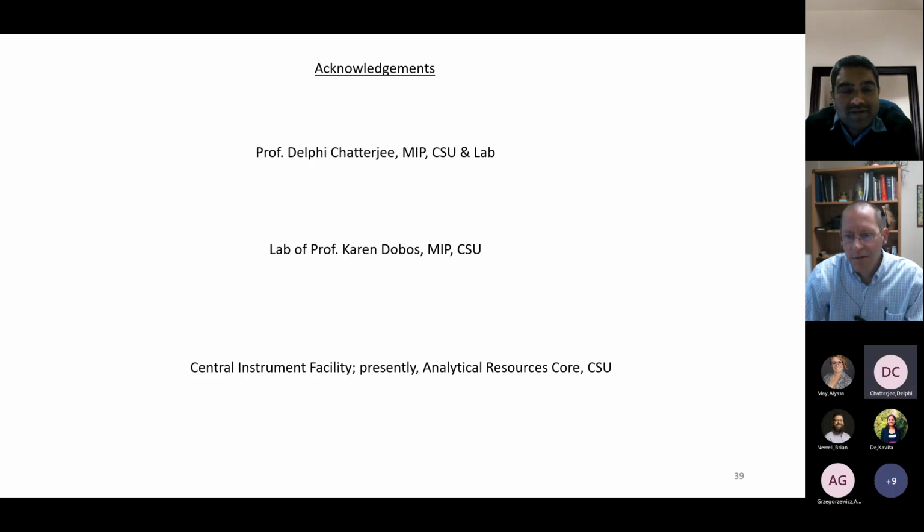Hang on, I have a quick question, Raj. That's a great seminar, thank you. These mechanistic fragments that you get, are these stable? You know, the small components coming out after fragmentation, or are there some conditions for that on a mass spec, or do you just do it by your logistics?